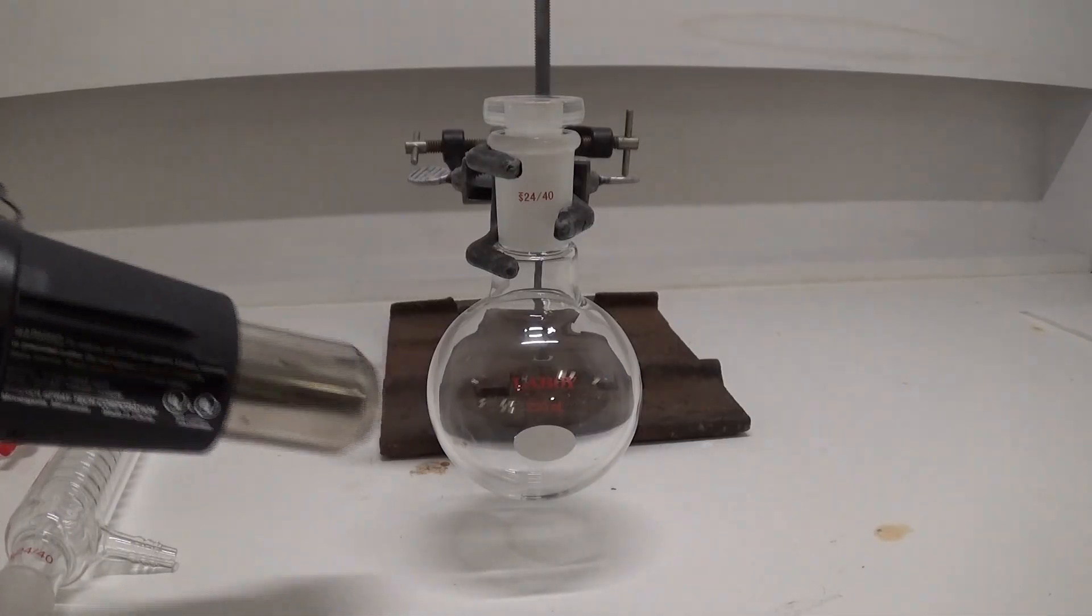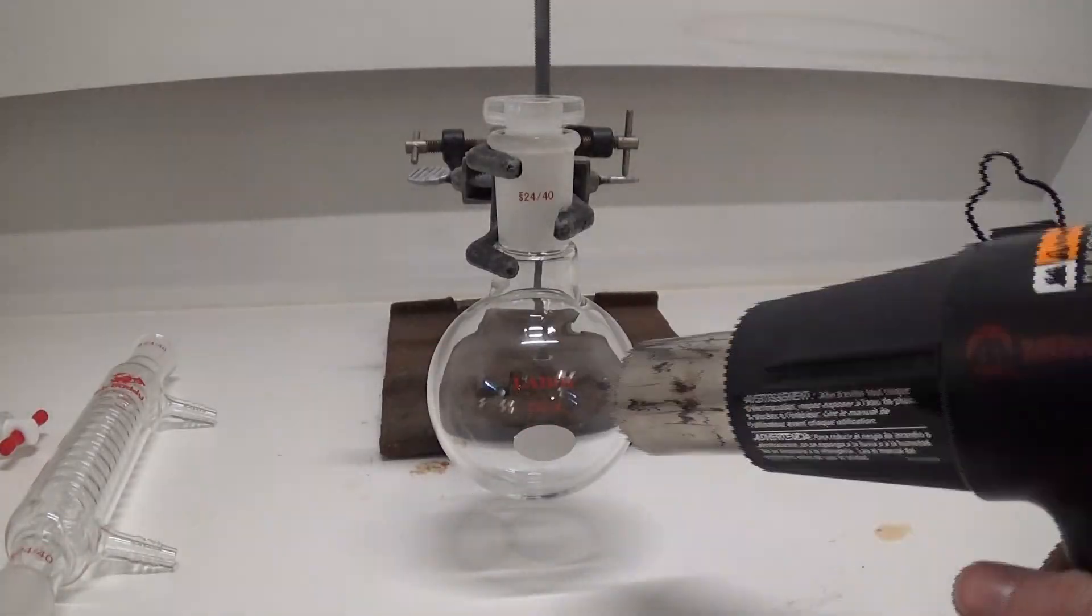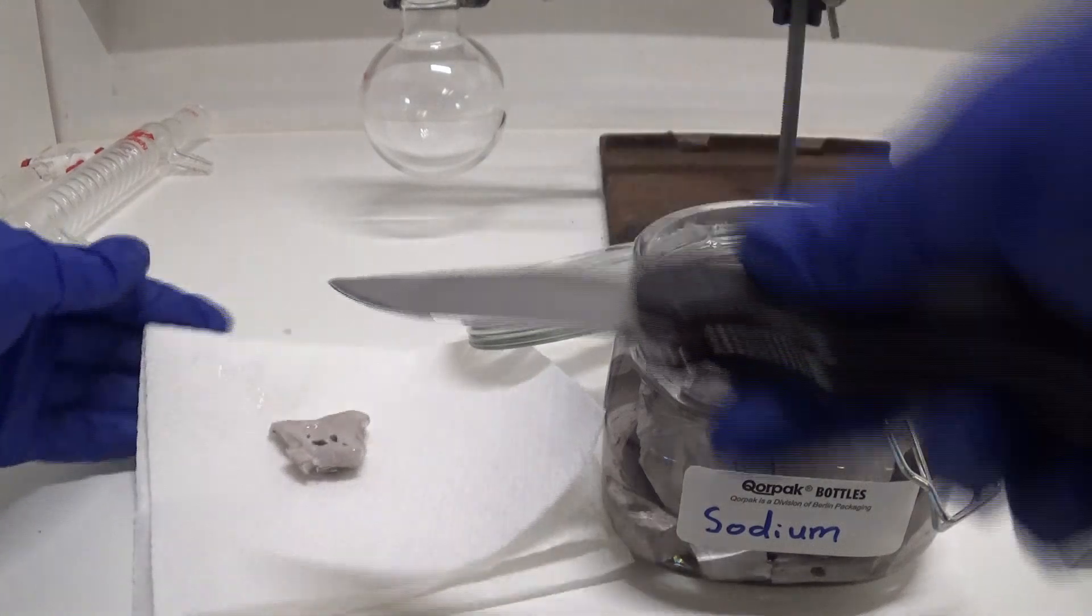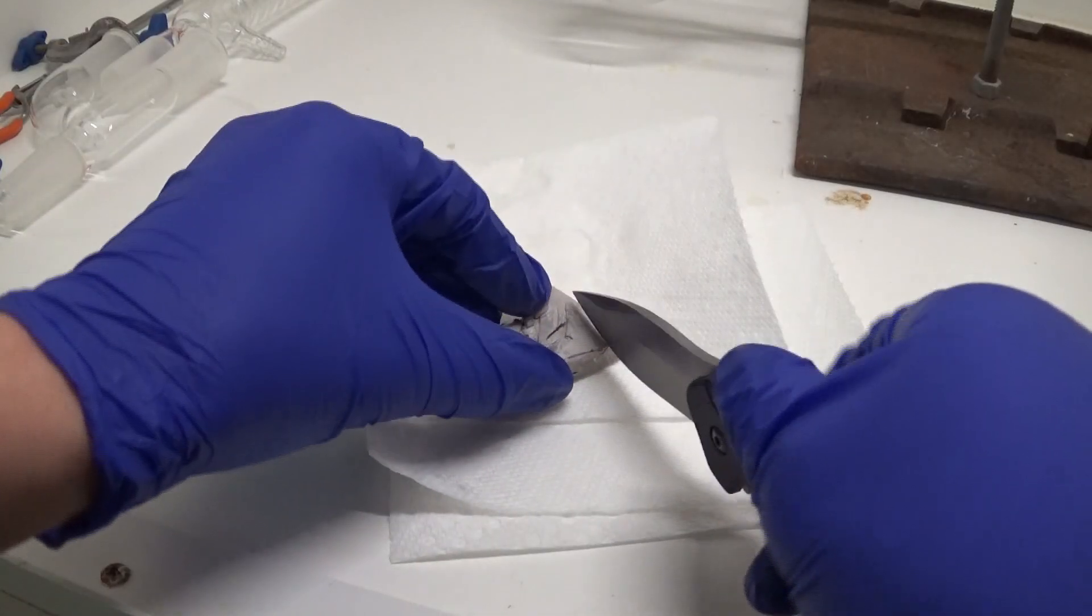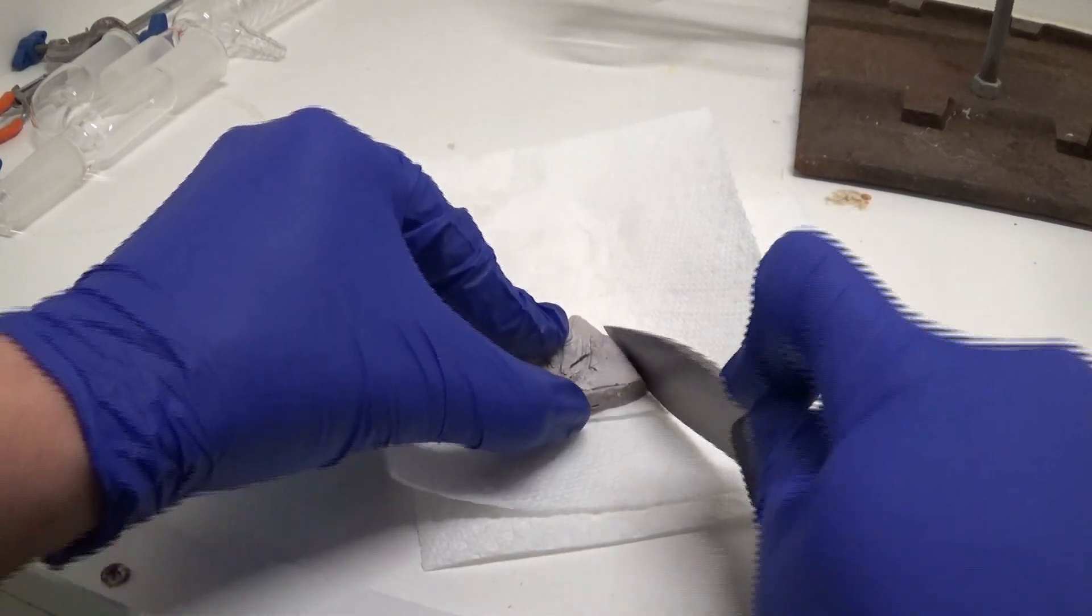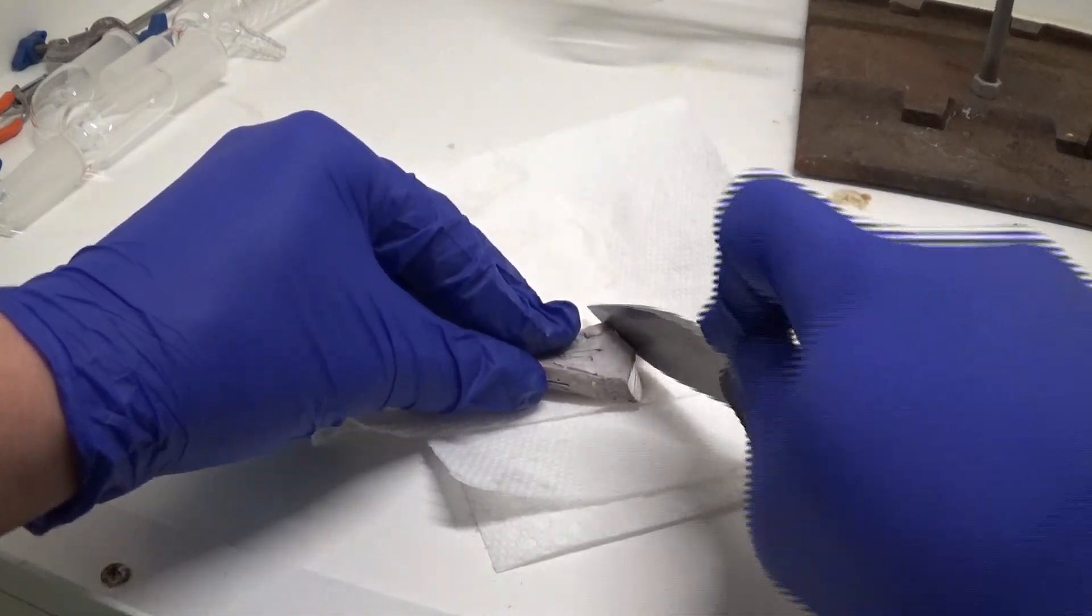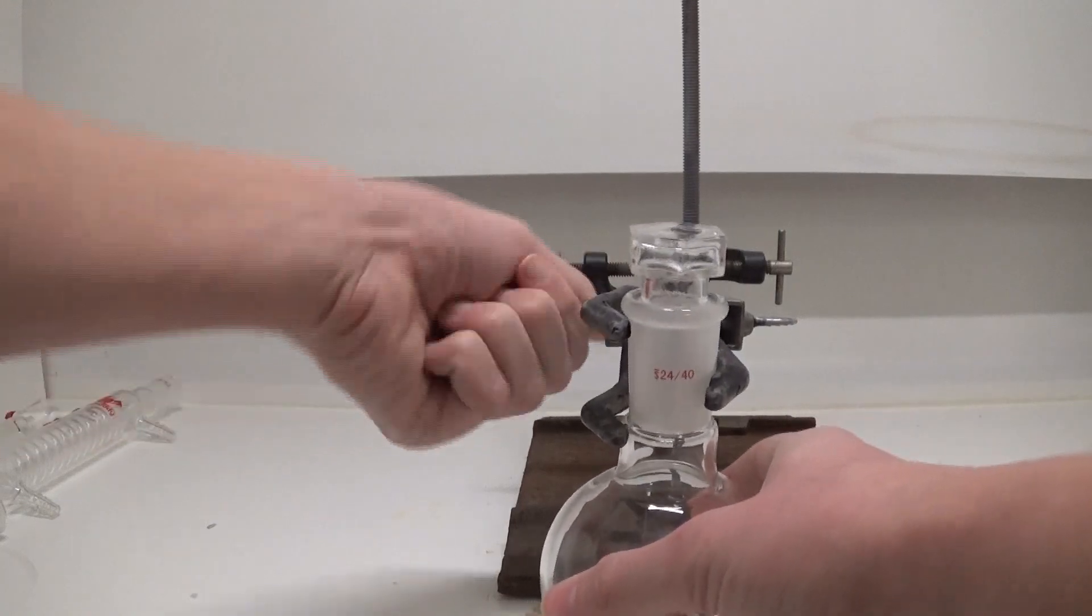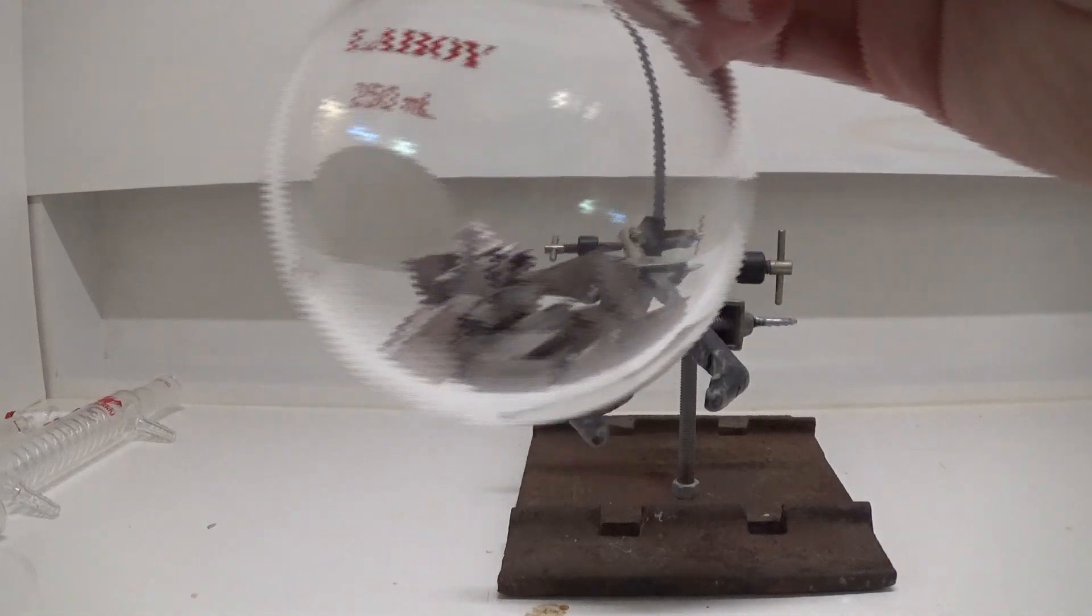I started out by drying my glassware. We're going to be using sodium and don't want any water to get into the system. Now sodium is fun to cut up, but it's also kind of difficult and tedious. It's a soft metal, but it's still a metal, and it takes a while. Here is all the sodium I cut up and transferred into this flask.